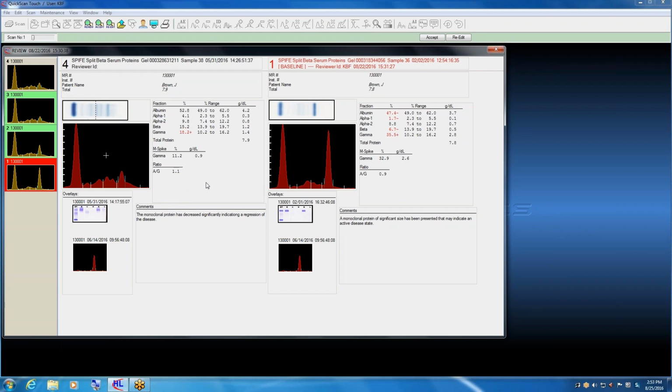One other item we're going to add is a post-it note, if you will. It's an inter-lab note. It's probably going to go in a text box right here, and it's simply communication notes that the pathologist may leave for the medical technologist, or the technologist may leave for the pathologist, just something that's going on with this patient that they might want the pathologist to know.